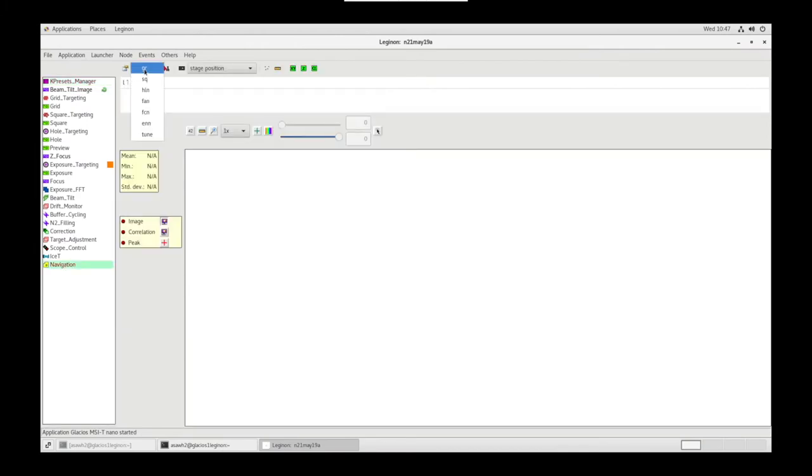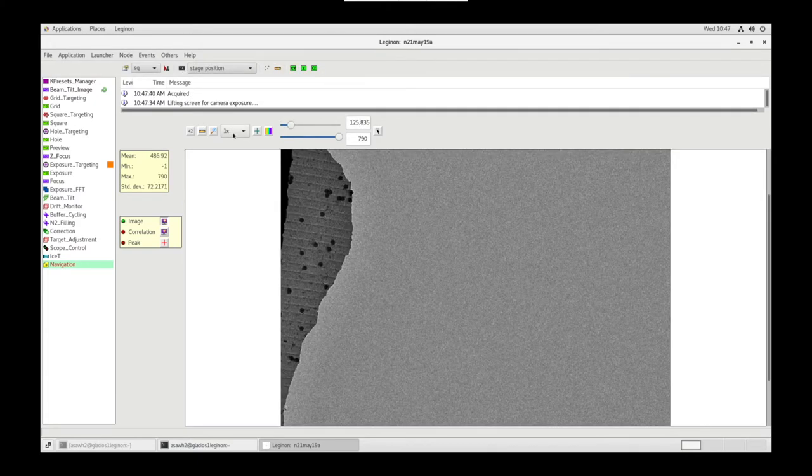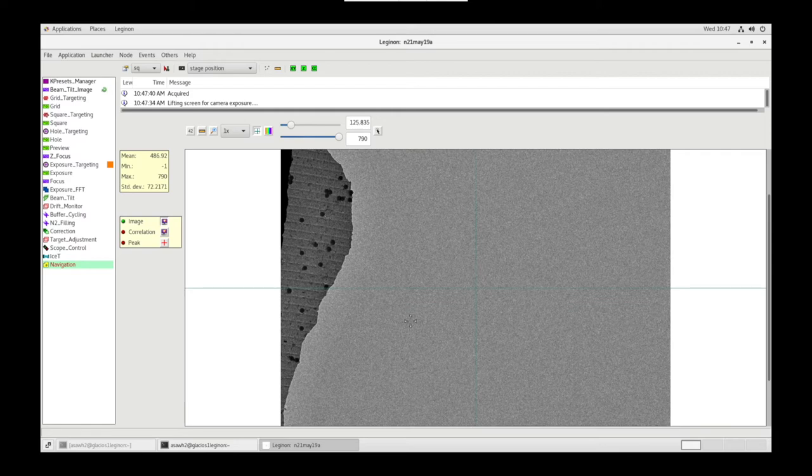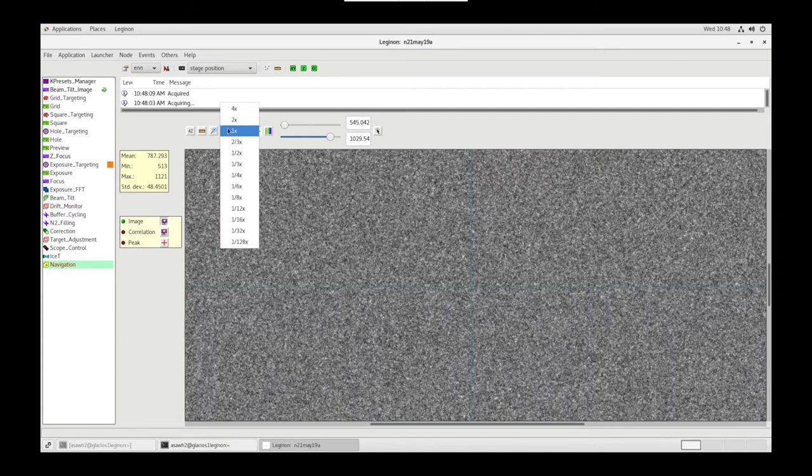In Navigation, let's send Square Mag to Scope. Acquire. Using crosshairs, let's see where we're located. We are over vacuum, so let's go up in Mag. Let's go to ENN. Acquire. This is to confirm that we are indeed over vacuum.